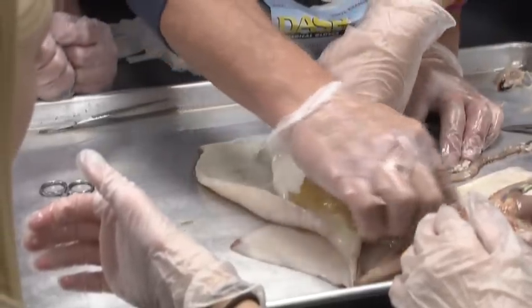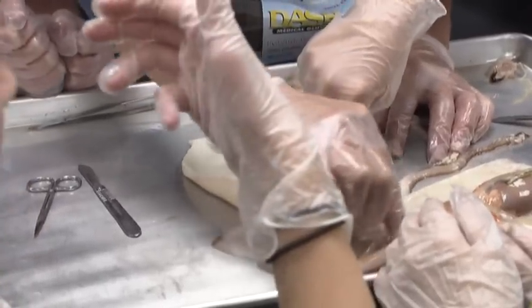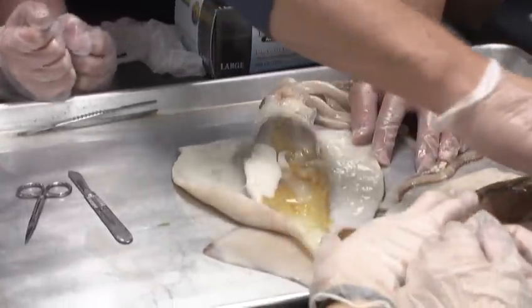This is all part of the digestive cavity here. And this is where they make the semen down here. And up here is the ejaculatory duct.